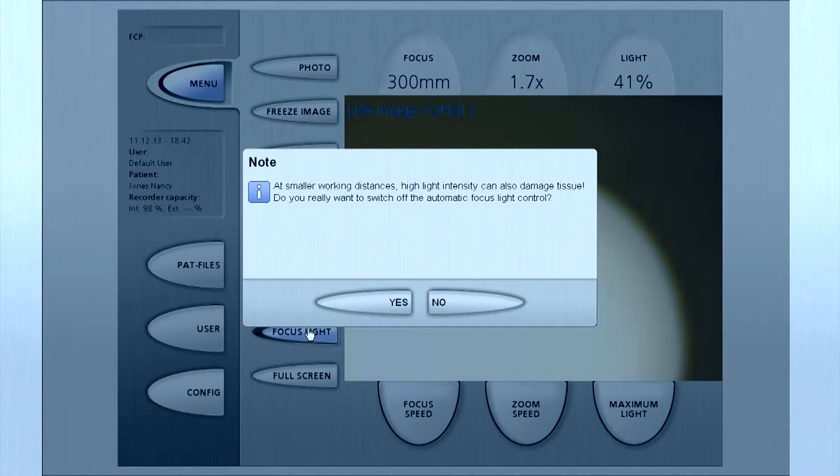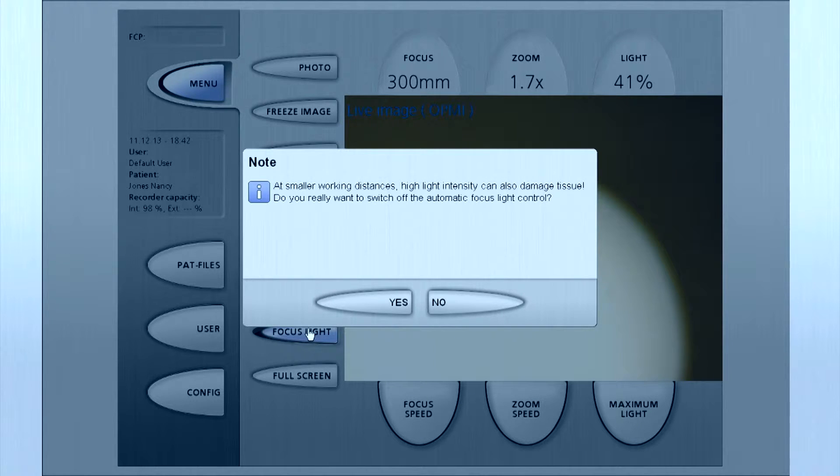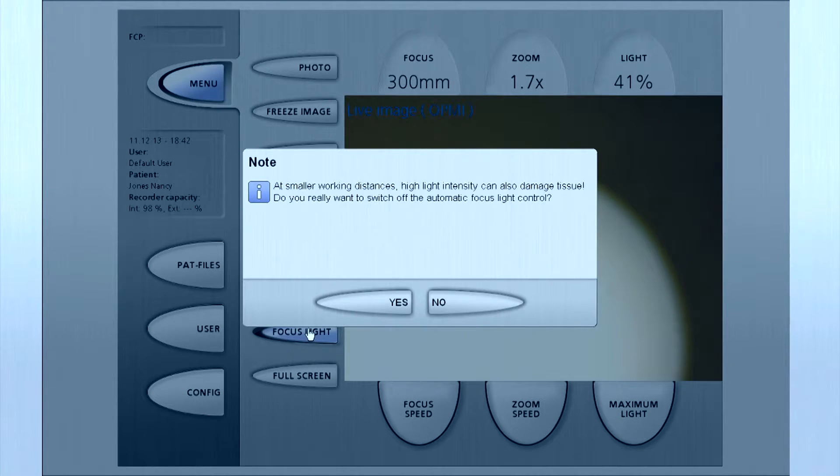To protect against these risks, critical safety features are embedded in this microscope.